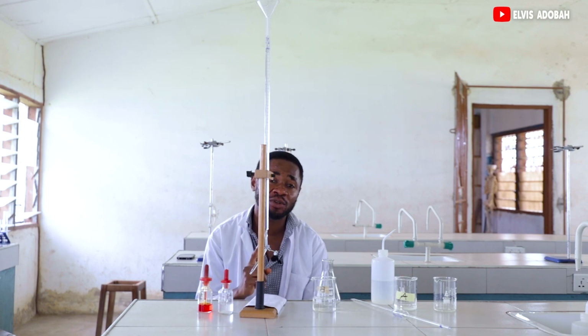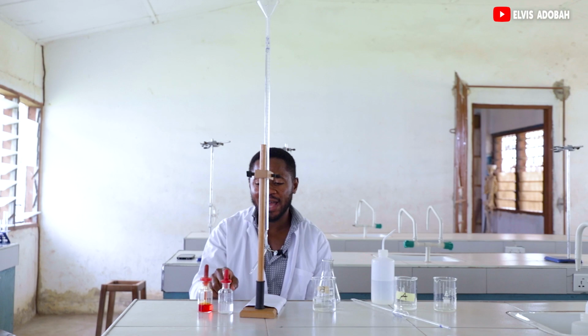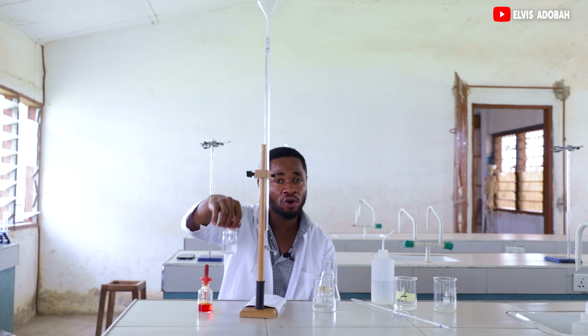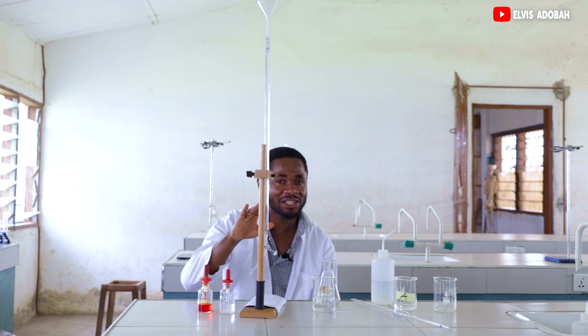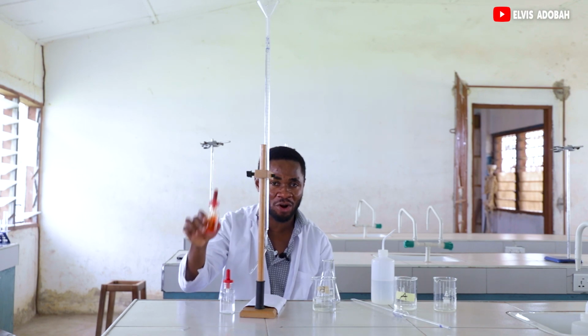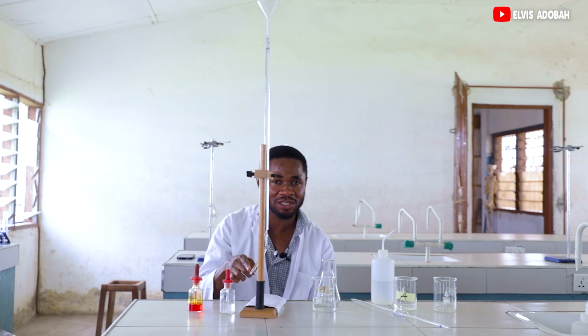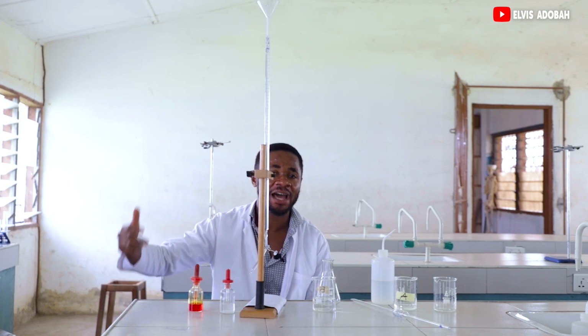In the continuous titration, we first add a few drops of the phenolphthalein indicator and start our titration. When the color changes, we don't stop. We add a few drops of methyl orange, then continue the titration. Hence the name continuous double indicator titration.